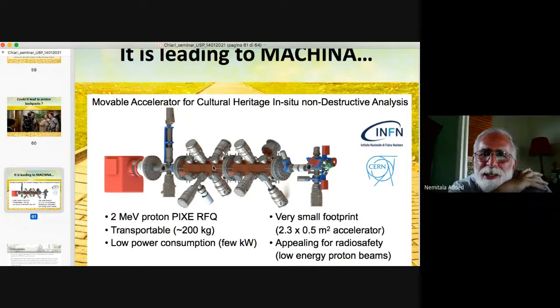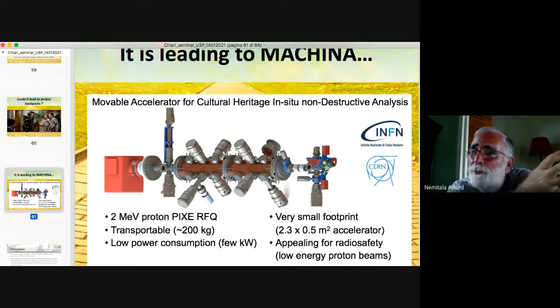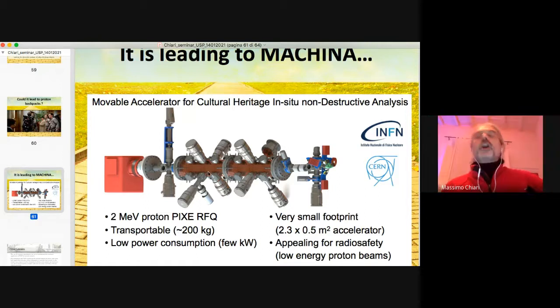Okay, can't you change your design to get a model of 1.5 MeV instead? Yes, they could have. If you change the energy, you have to reshape the structure inside, and also the acceptance of the initial beam. They designed these modules because they were using them as an injector for a high energy proton beam for radiotherapeutic applications, and so we were using that design.